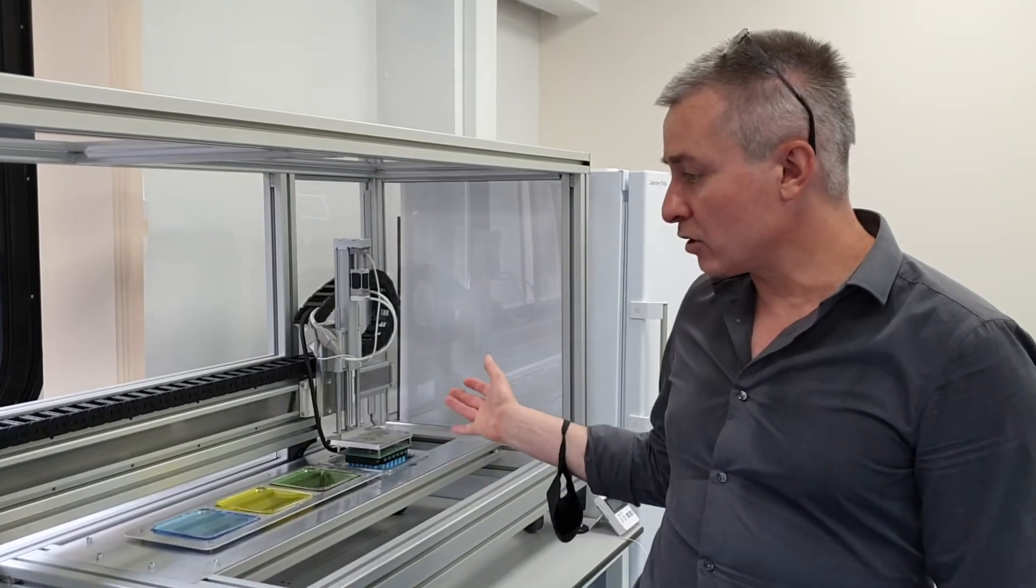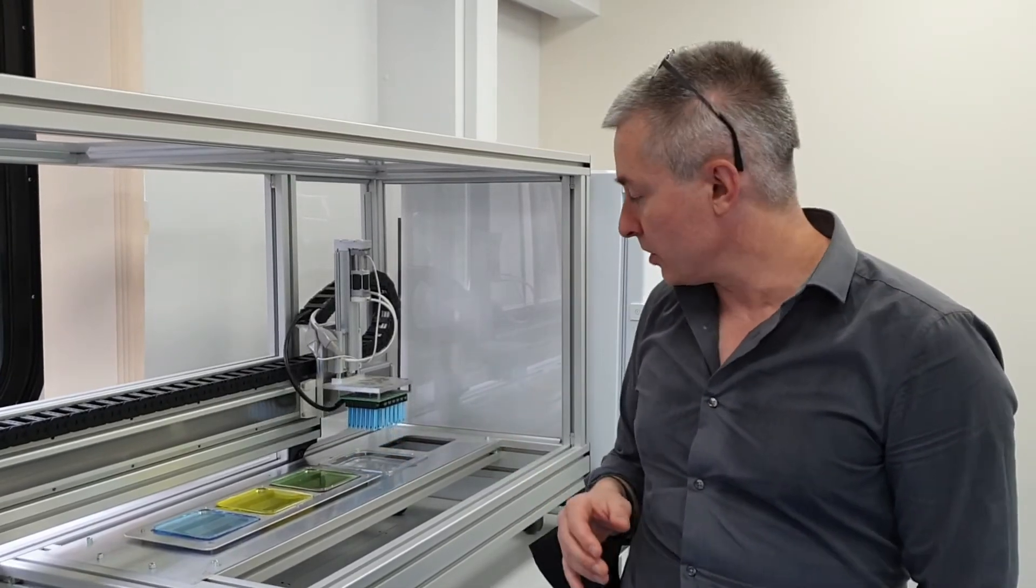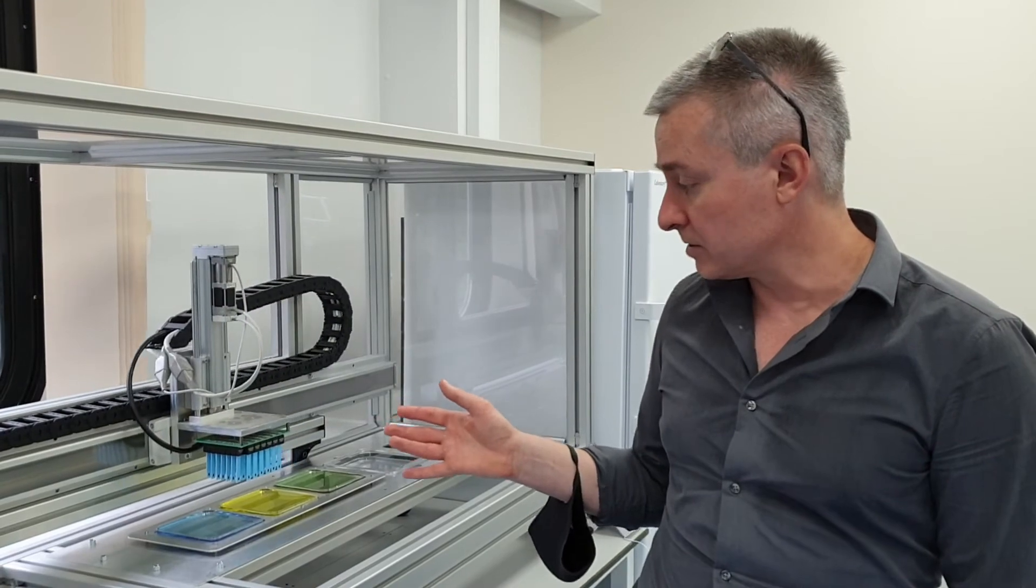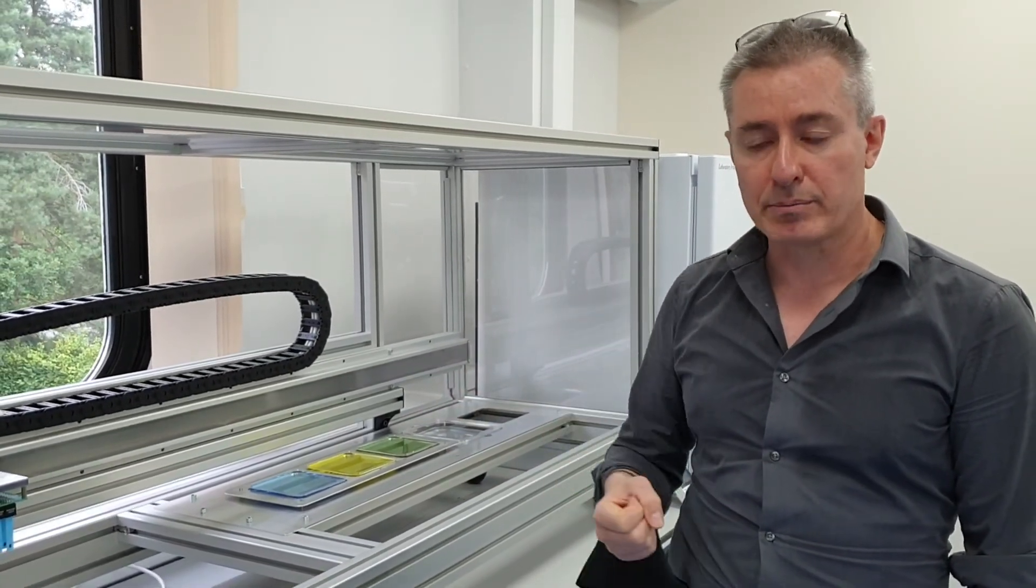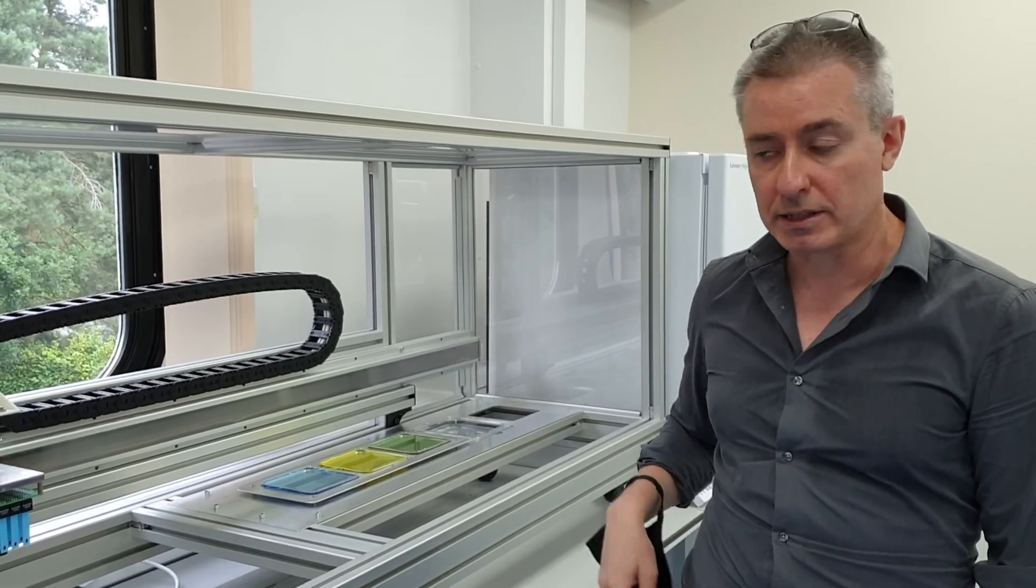Now this entire run, we're just doing a little demo here, takes about one minute, six seconds. So it gives you a sense that you can do 50 or more electrodes in about a minute. So it gives you a sense of the kind of higher volume type manufacturing you can do with a robotic system like this.